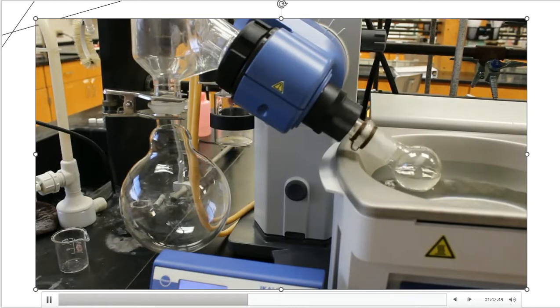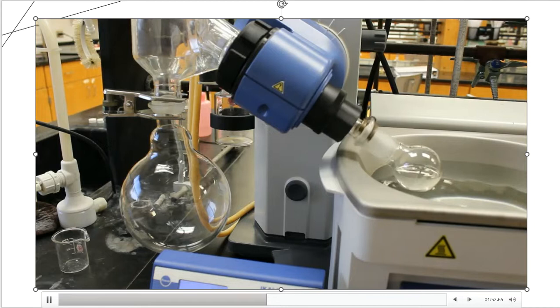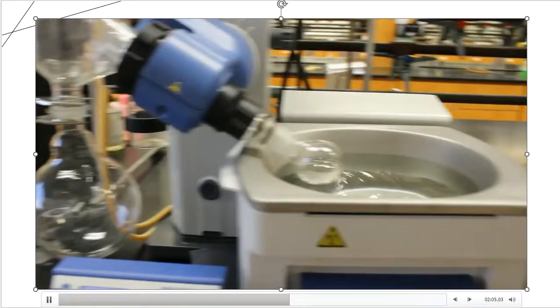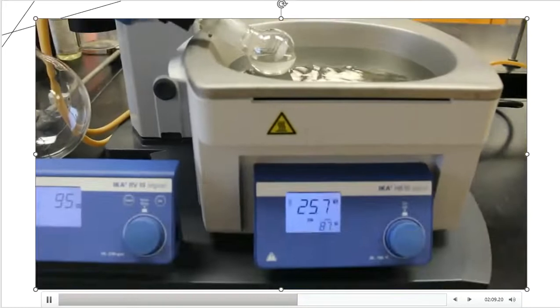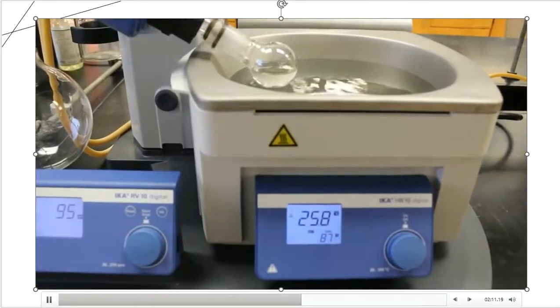So I'm just going to let this turn. I'm going to let this heat, and I'm going to come back in a few minutes and take a look. And at that point, all of my methylene chloride hopefully will be gone, and I won't have to worry about it. It makes my life very, very simple as far as the distillation process goes. So no glassware, nothing crazy, nothing fancy is going to be needed. The water bath is a typical water bath, ladies and gentlemen. There's really nothing here that's special.